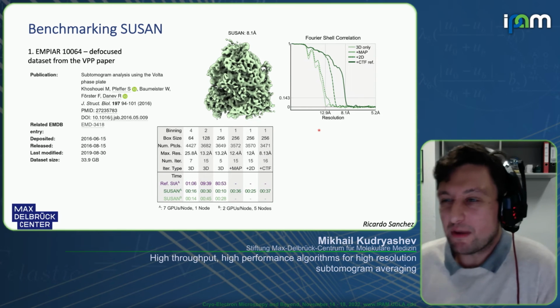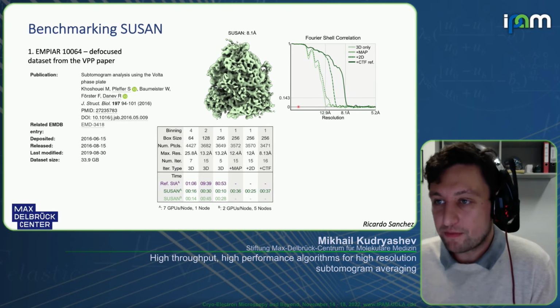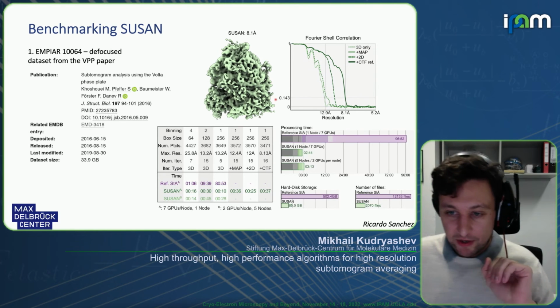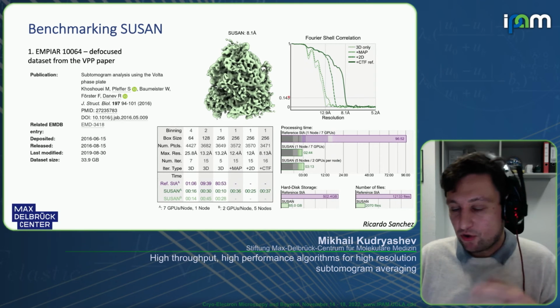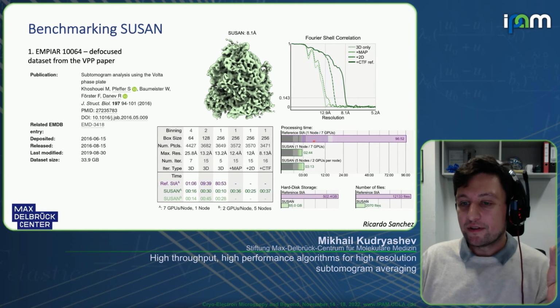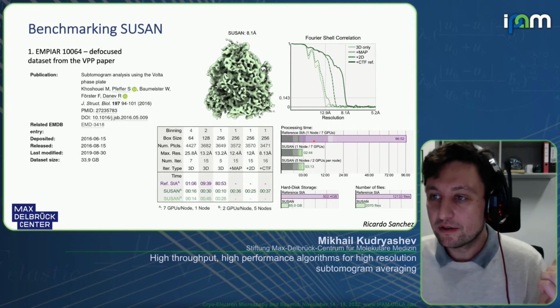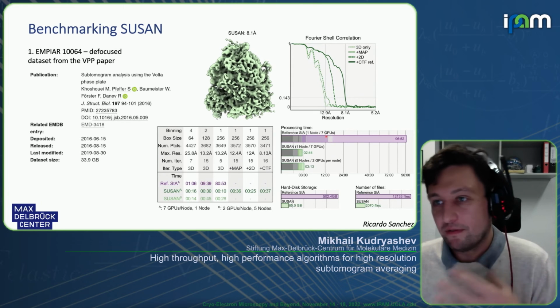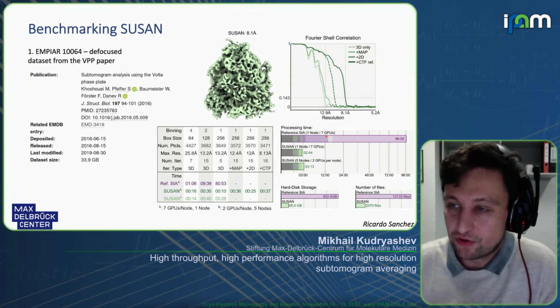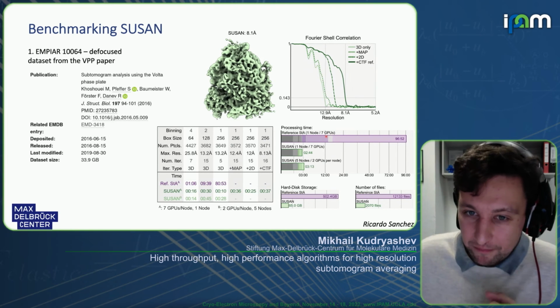So basically, these steps probably could be performed iteratively, but we didn't want to spend too much time on purified ribosomes. The important thing here is that we performed this on the same hardware and compared the processing to the reference quick subtomogram average, and it was Dynamo. But the feature about it is that it was doing the conventional subtomogram averaging with 3D volumes.